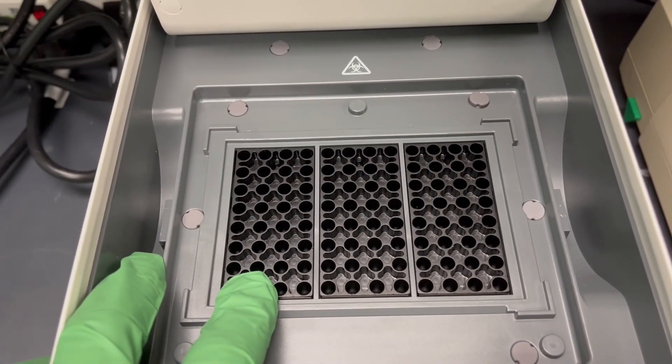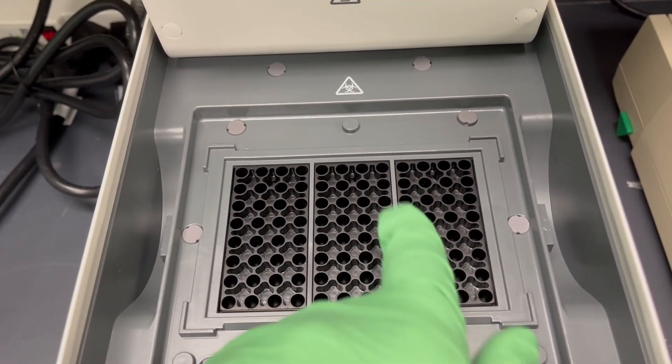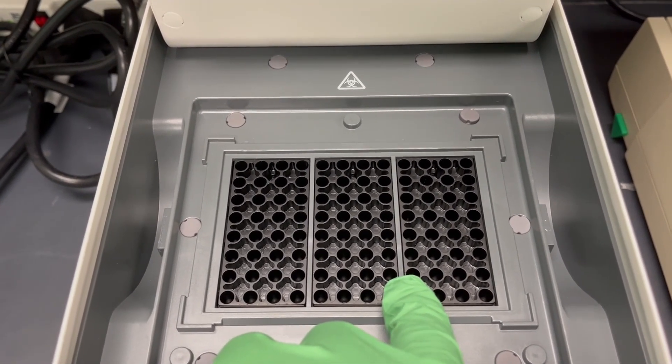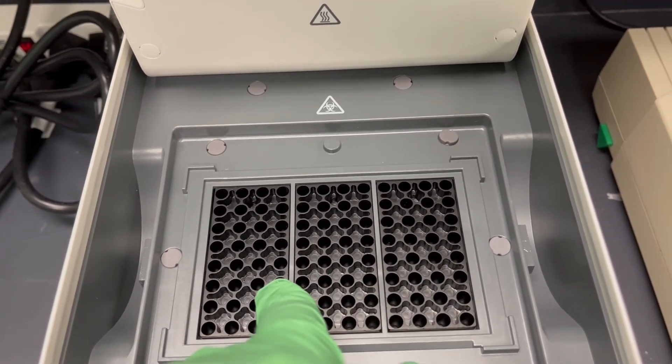What's interesting about both of these machines is that each block that's separated can be run at a different temperature. We can talk about how to do that if you're interested in doing a gradient experiment or some experiment where not all the samples are getting the same protocol.